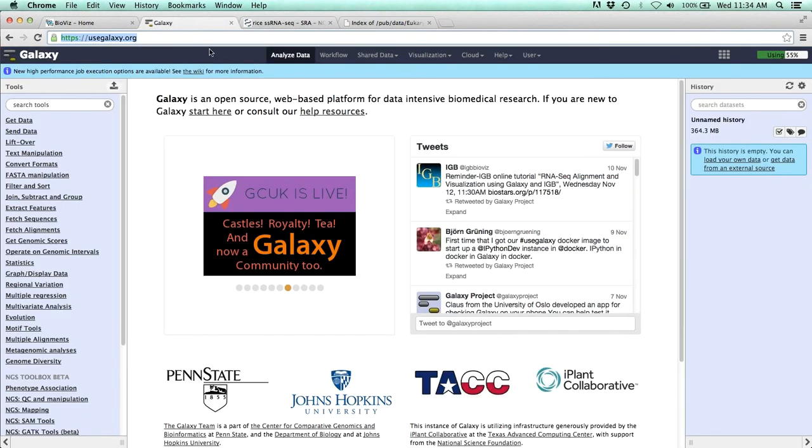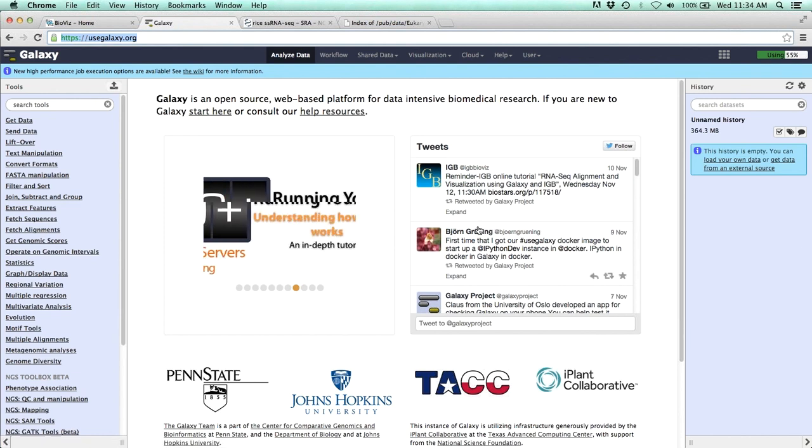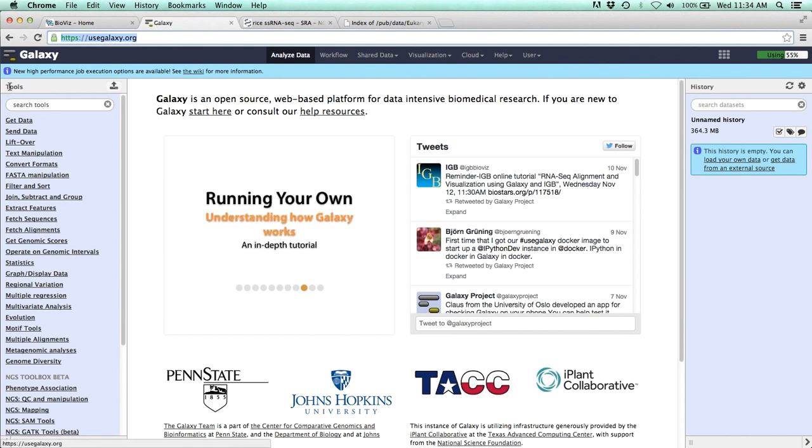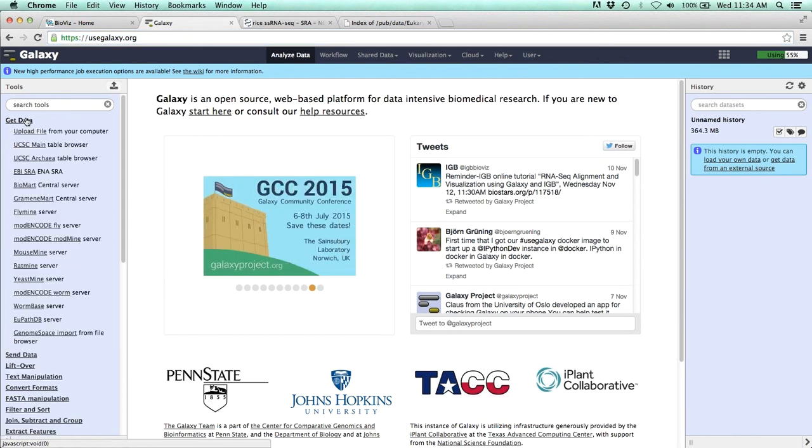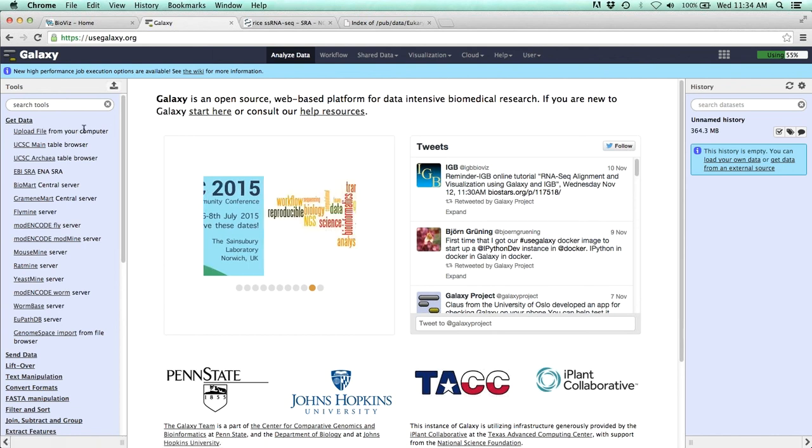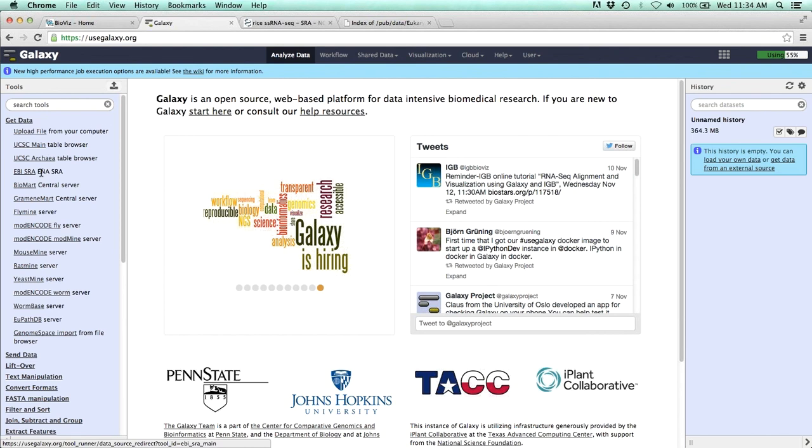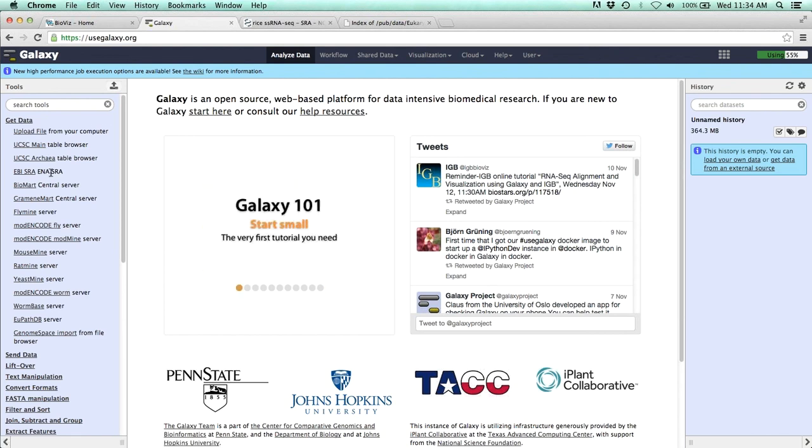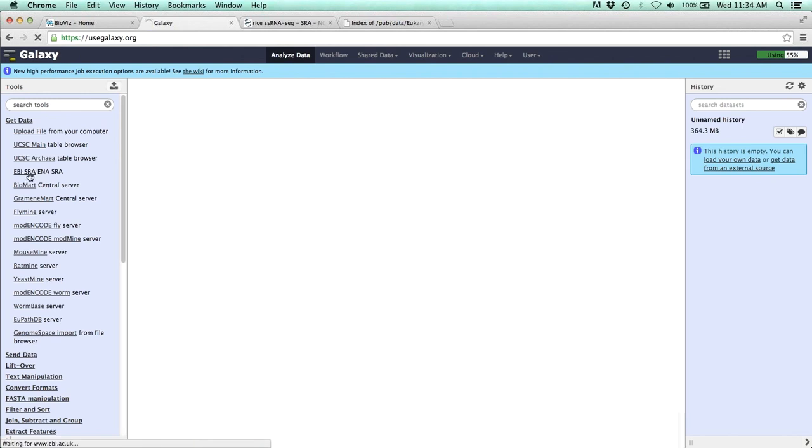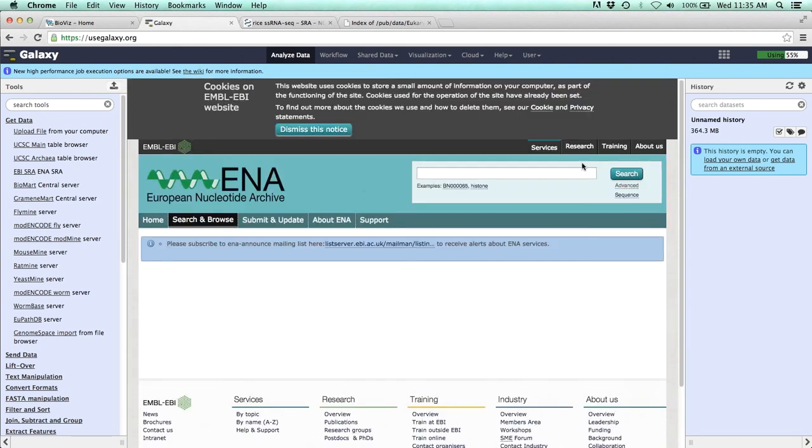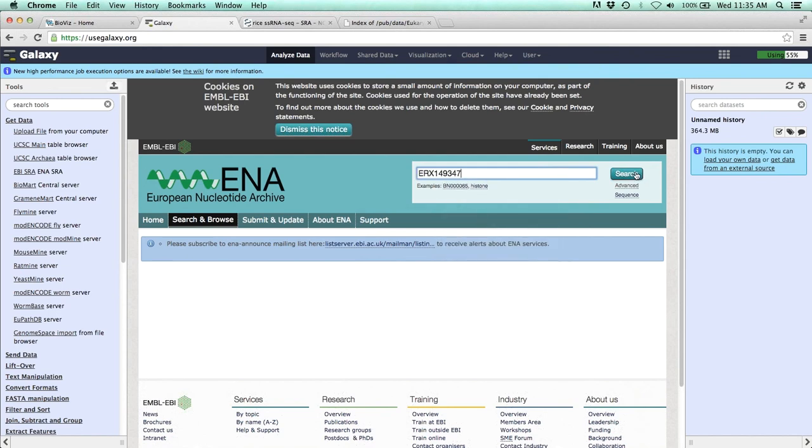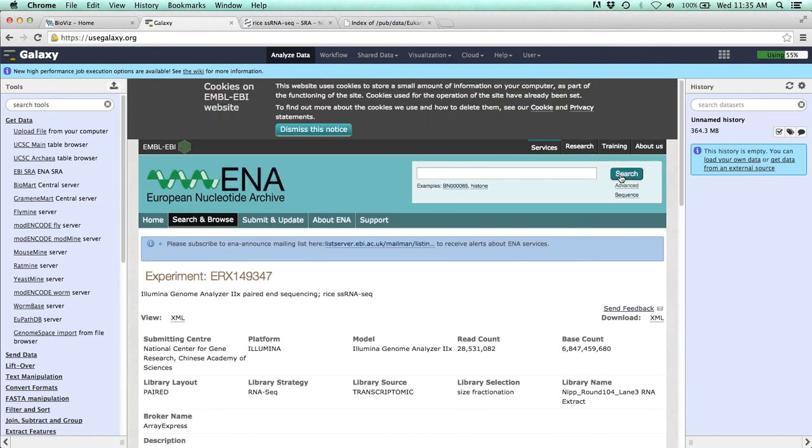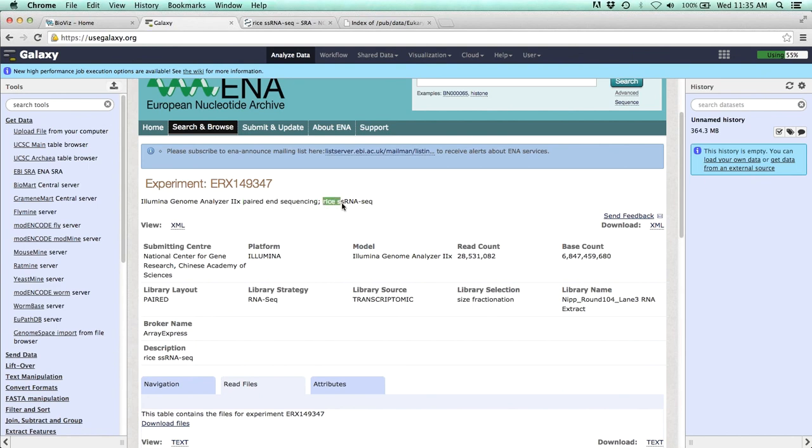So I'm just going to copy that. Then we can go back to Galaxy. I've started an unnamed history. We can go over to the tools and go to get data. The first thing we need to do is get our data into Galaxy. In order to get the SRA sequence files in there, we can go to this EBI. This is the European Bioinformatics Institute's SRA website, and it's linked directly through Galaxy. So I'll just go ahead and paste in that accession number. So we get that same exact experiment. This is an Illumina run, and it's paired-end sequencing. That's important. We'll need to know that for later.